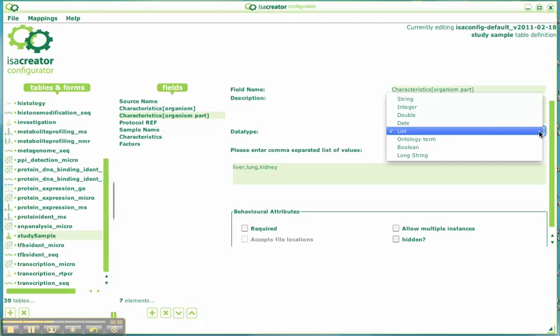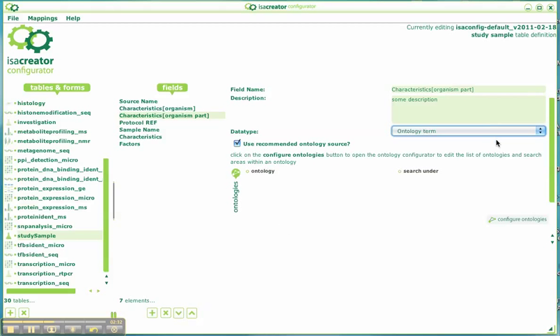Finally, the choice of ontology entry. This is probably the most interesting and most advanced use and the most interesting for data managers, because it allows you to select a vocabulary that is usually used by a community, and within this vocabulary either select the entire space of the vocabulary, but also restrict it. So I'll show you that right now.